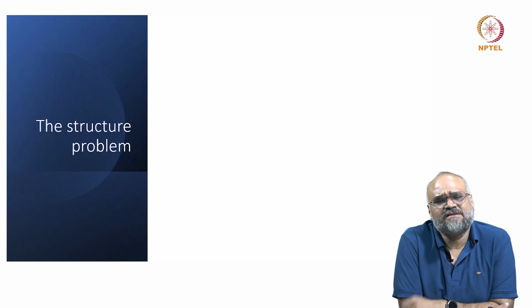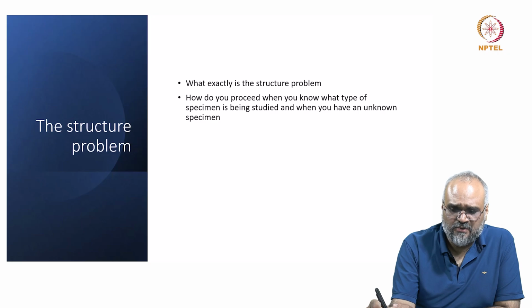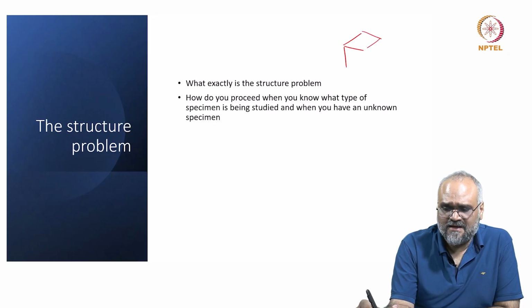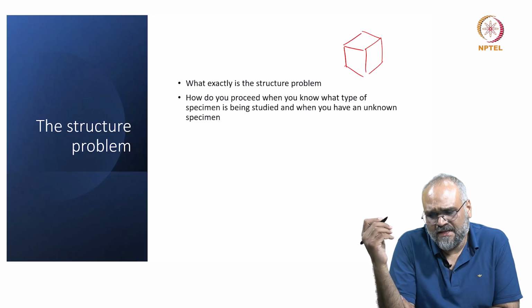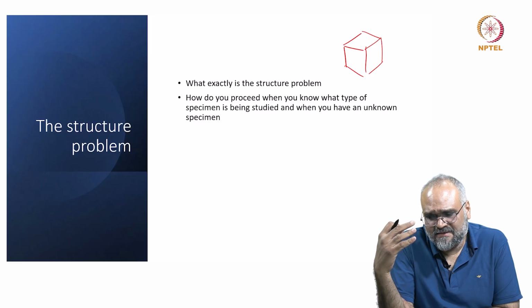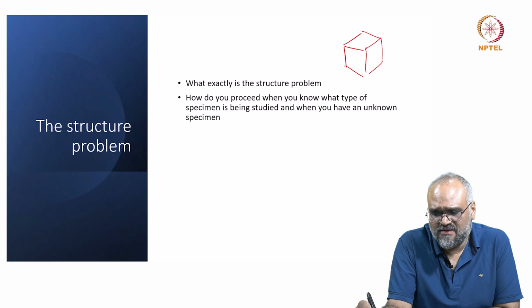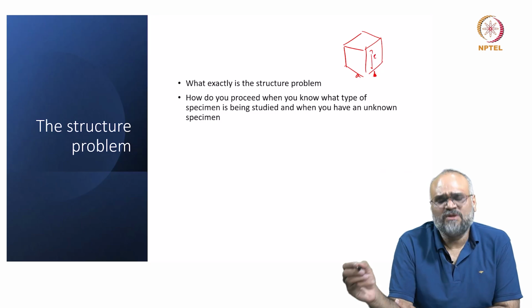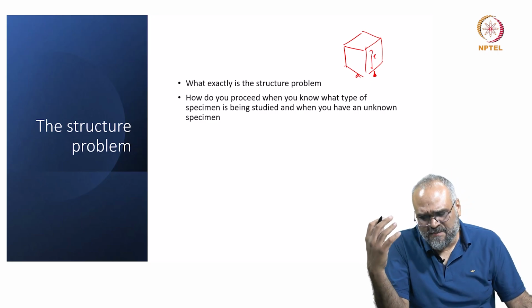But either way, we are solving the crystal structure. The crystal structure problem, if I simply put it, is that I have atoms arranged in some periodic fashion within a unit cell, and I would have three different parameters that determine the crystal structure. The first one is what are the dimensions of this unit cell. So, if I call these three A, B and C being the unit cell vectors, I would want to know what my unit cell parameters are.